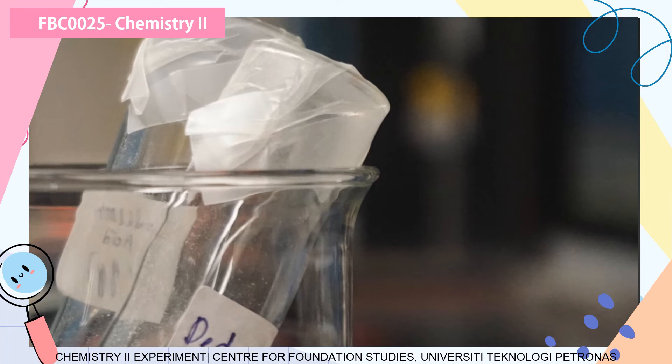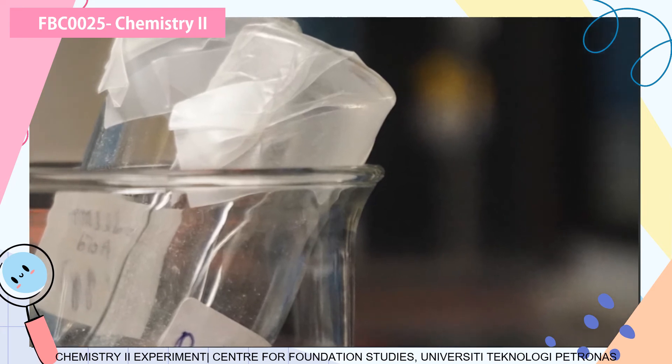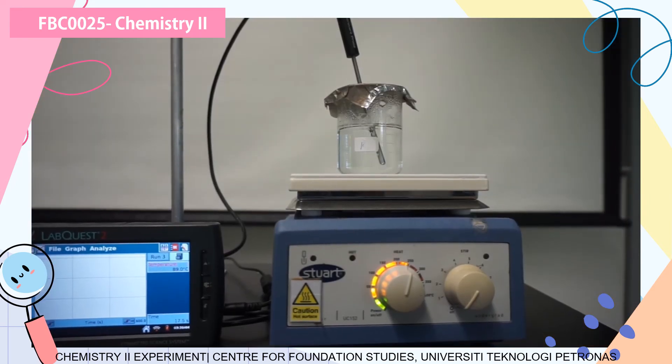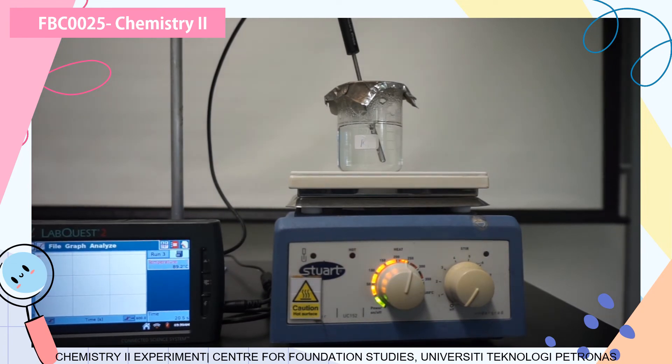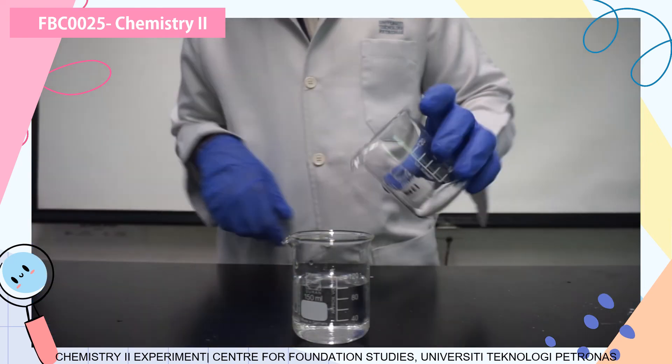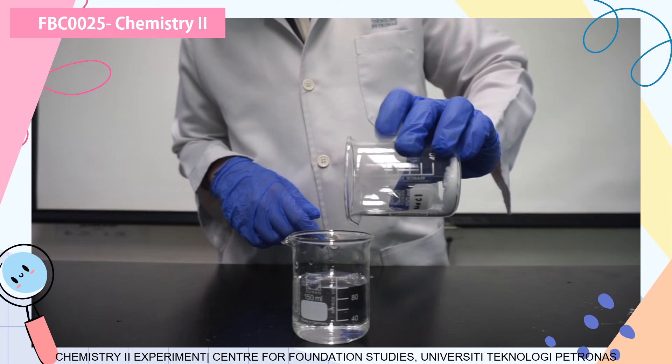After that, we are going to poke a small hole on the aluminum lid. When we poke a small hole there, we are going to insert the temperature probe. For the temperature probe here, we are going to start collecting the data. Make sure that the temperature reaches around 90 degrees Celsius based on the lab manual. Once it is 90 degrees Celsius, you can click start on the LabQuest interface there. Once you click start, you will get the data.